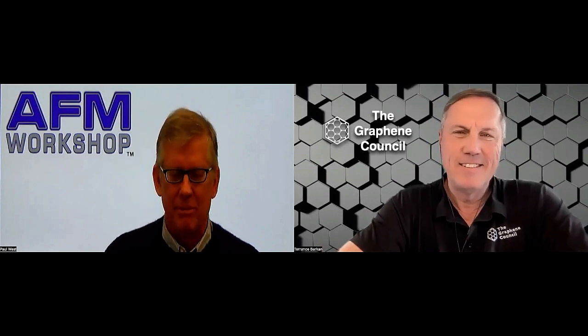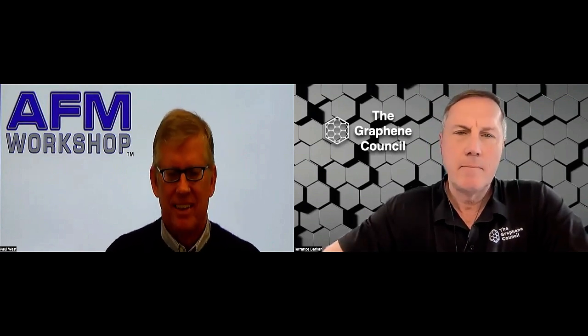And I think one of the things about these microscopes is you only ever see the best image everybody ever measured. Right? Especially with research publications, you'll find somebody measured 200 images and they published one image, and just a section of that image. And so that gives a false impression.